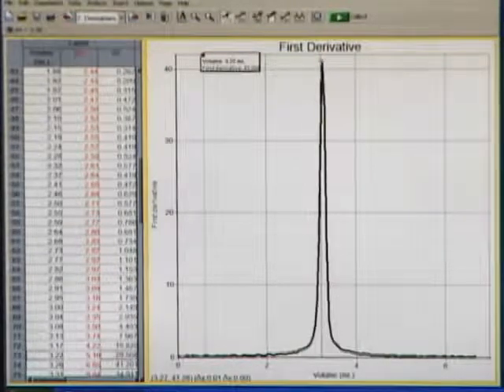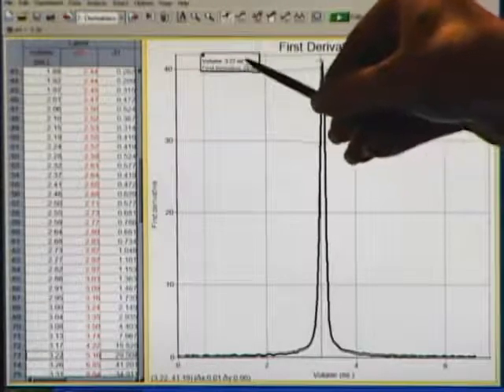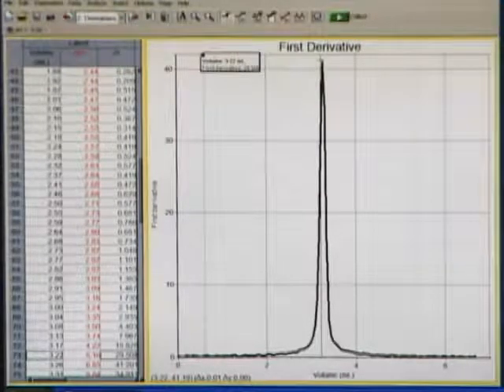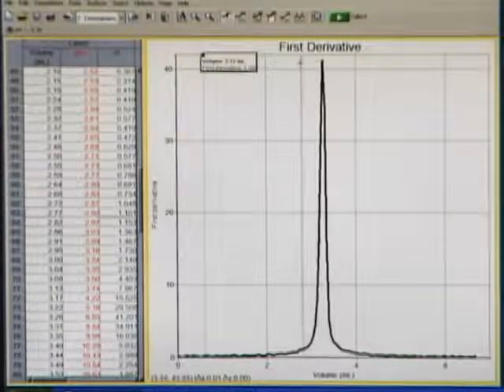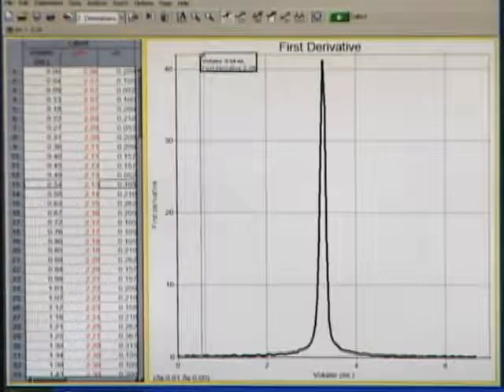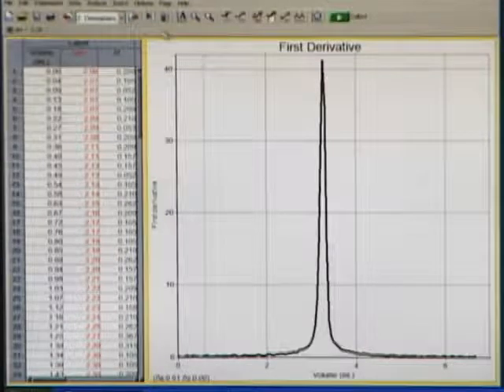Even better than first derivative though, a second derivative. So I'm going to close out this first derivative, go to the next page button again, and here's our second derivative. Our equivalence point is going to be right where that second derivative crosses the zero line.